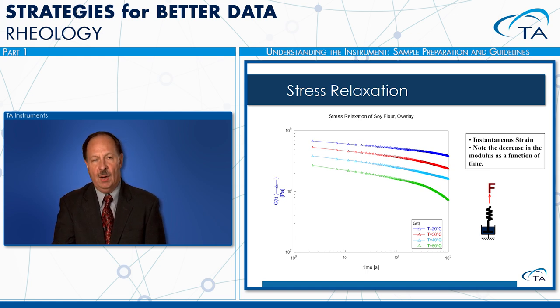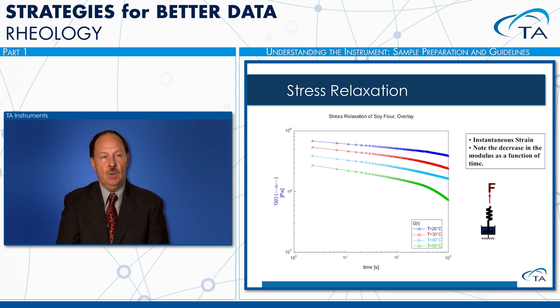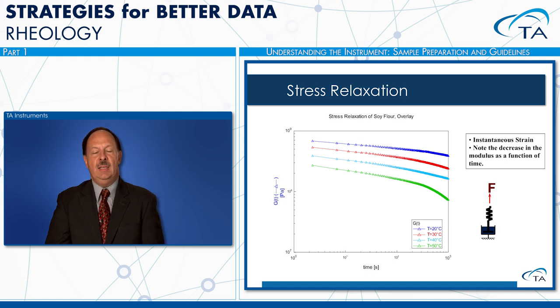Now, I have a little element here. We're going to talk about these in a little bit. This has a spring and what we call a dash pot. And sometimes we can use these physical models to help us explain the viscoelastic behavior that we see when we do the testing of materials on our rheometers. So let's go into this idea of viscoelasticity.